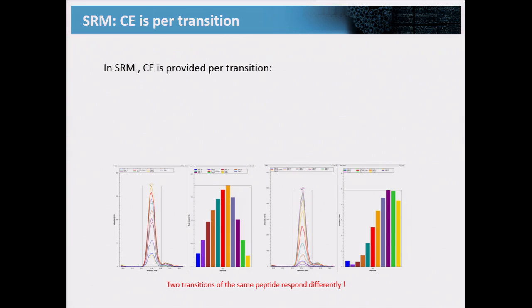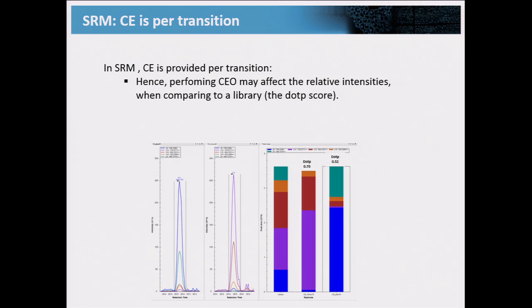the default collision energy, but for this transition, if we had increased the collision energy, we would actually gain in area. Now, Skyline today also allows you to do these procedures and store them, so you can do the whole procedure and then save per precursor or per transition collision energy information, and always use that for your project.